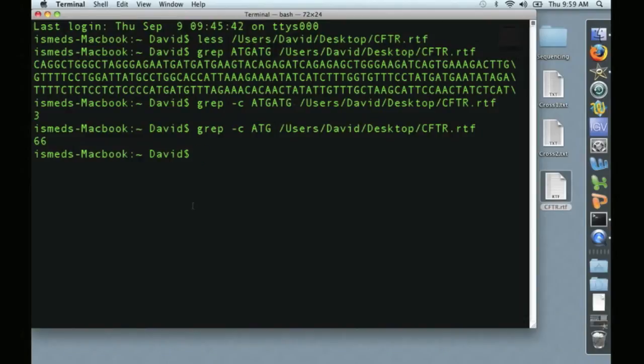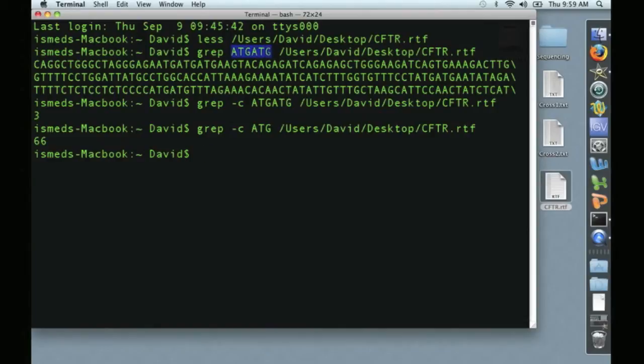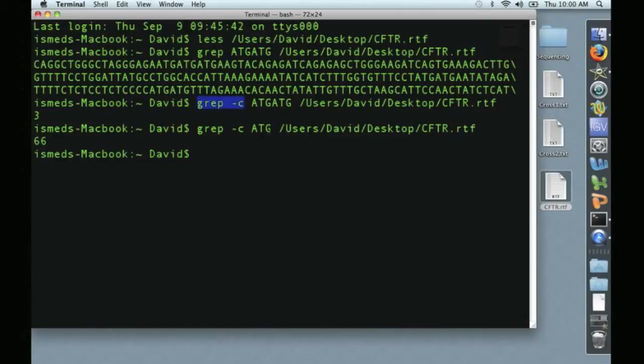That's it for the first video. Just to recap, we've used LESS to display information within a file, we've used GREP to search for and display some sequence or piece of information in a file, and we've also used GREP to count the number of times something occurs in a file, in this case ATG ATG or simply ATG.